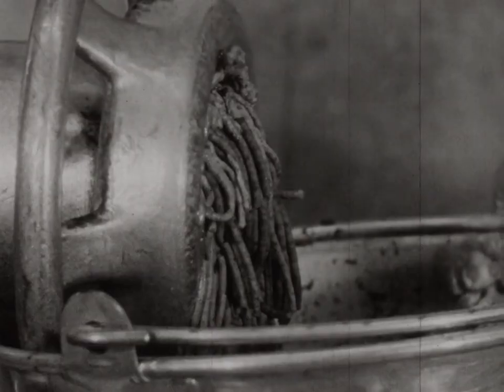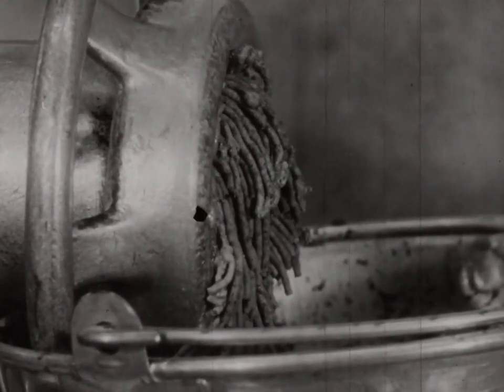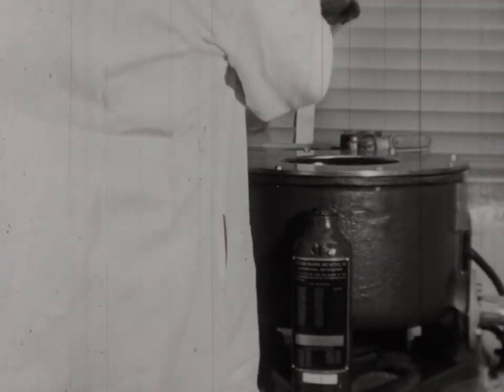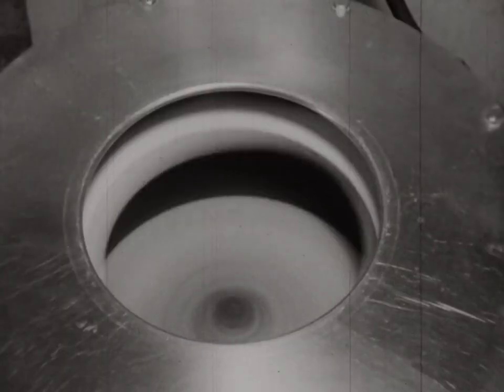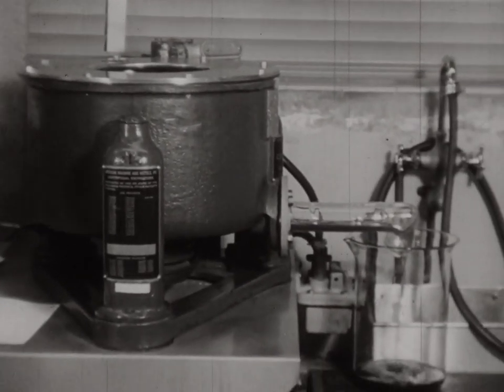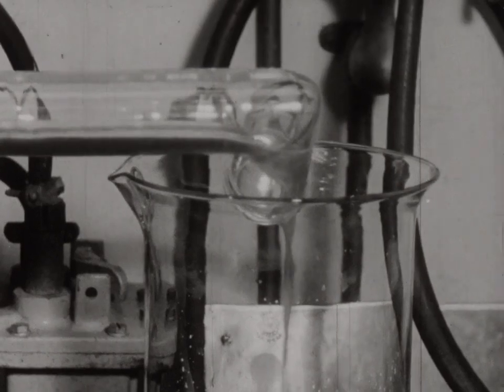And after we have hamburgered up a pound or so of this material, we are then ready to extract the juice. We do this by putting this stuff inside of a spinning centrifuge with a cloth filter, and we whirl the juice out of the leaf debris, leaving the large leaf material behind and having only the juice containing the virus particles and the plant pigments in a colored fluid.